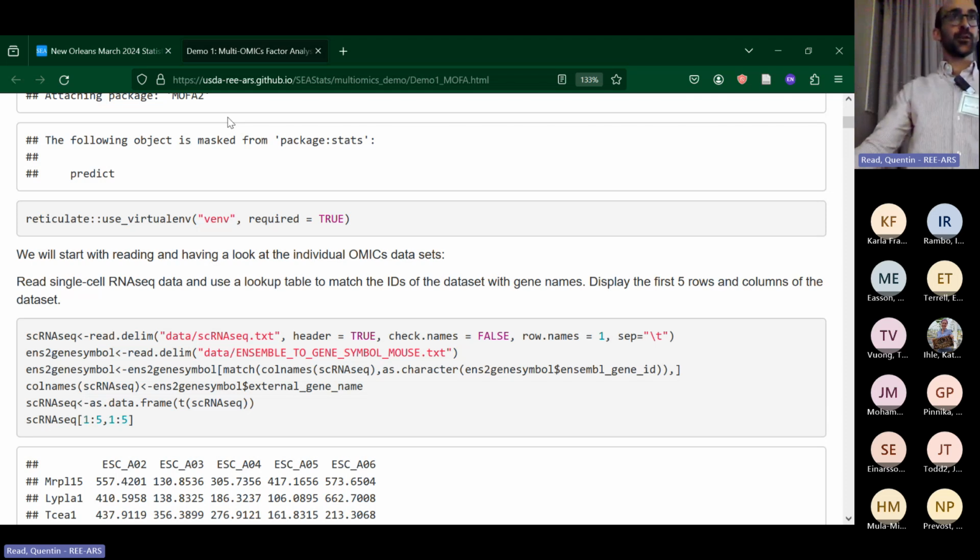It is not crucial that you run this along with me because you don't really have to type anything. You're just going to click run whenever you get to some code and see the same thing pop up on your screen that I have. I wanted to make that option available to you if you want. Do not feel obligated. You can just watch what I do and be wowed by the pretty colors flashing on the screen. But it's up to you if you want to actually run it yourself. You have that ability because it's all installed and ready to go.